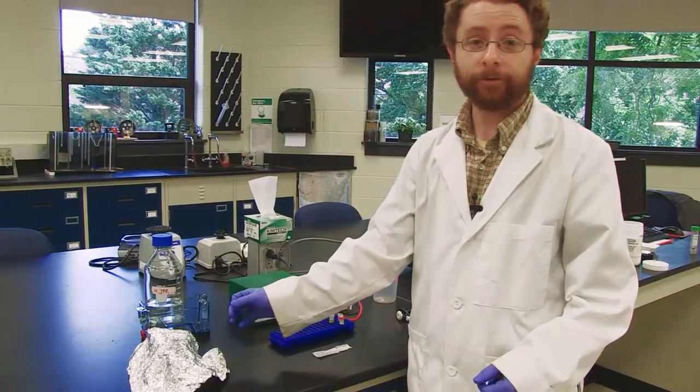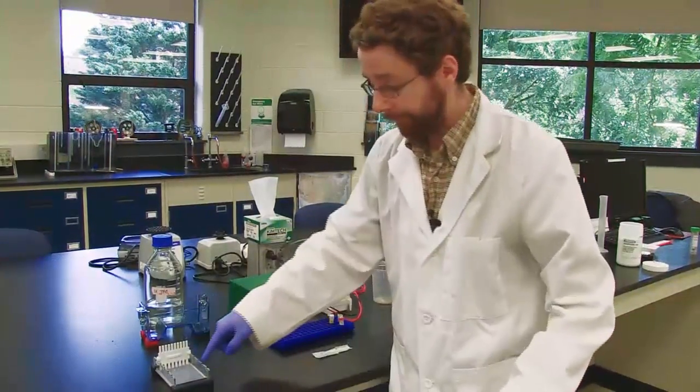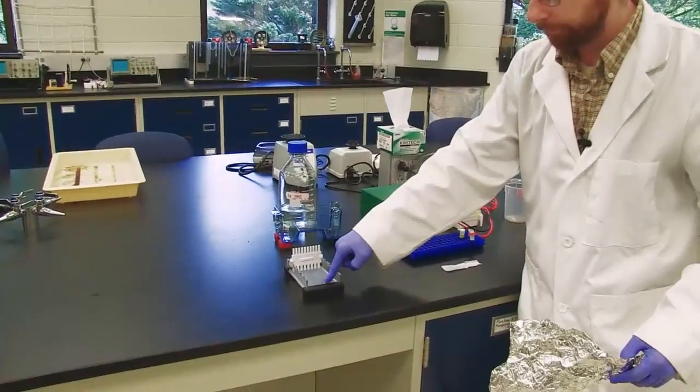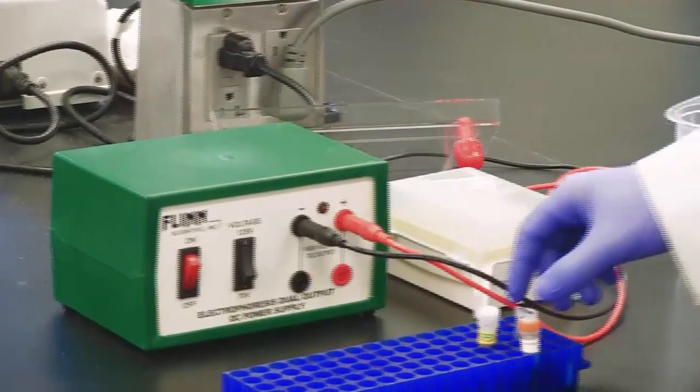So let's see if our gel has now solidified. And you can see that it has, and you know, if I touch it, it feels like a very hard jello. Okay, so our gel is ready for the next step. Okay, I'm just gonna cover it while we begin preparing our DNA samples.